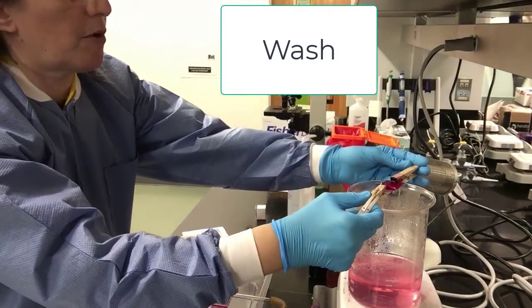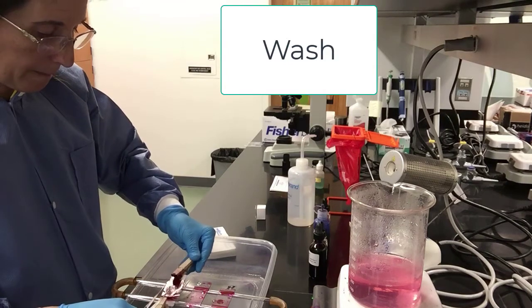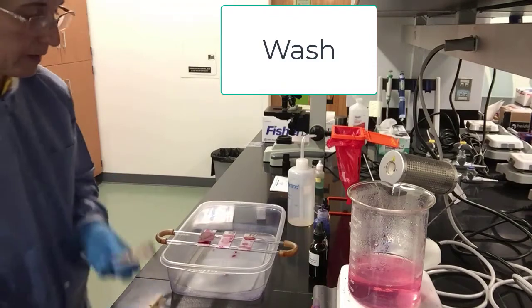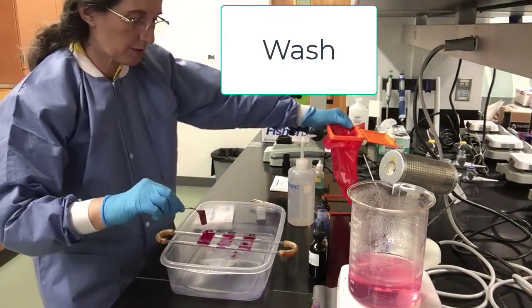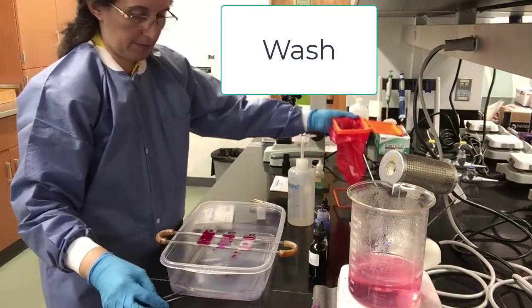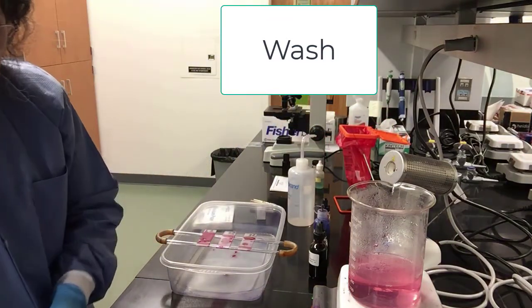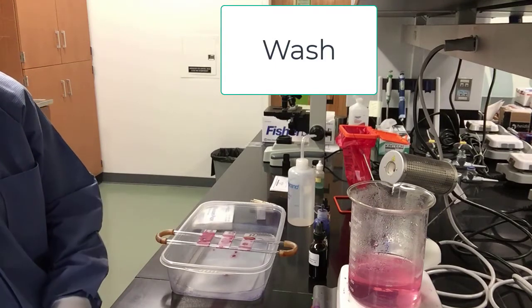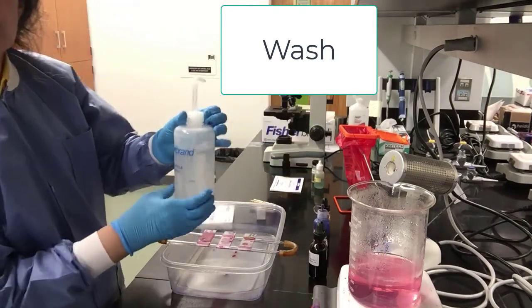We are back. We have taken our slides off the steam, and this is our last slide that we're taking off the steam. We unclip it. And then that little piece of bibulous paper that we used, we pick that up with a little tweezer carefully from the end, and we just throw it in the hazard trash. Even though the bacteria now are dead with the stains, they're not harmful. So now we are ready, after we cool our slides for about a minute or so, to do our washing. We use distilled water for our washings.